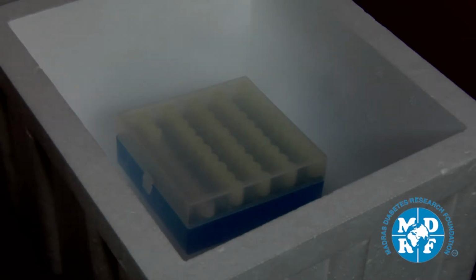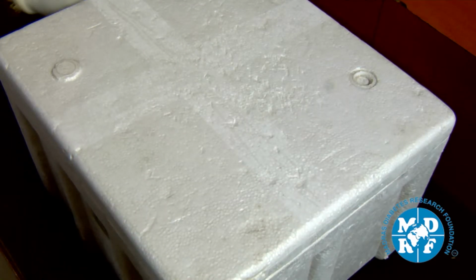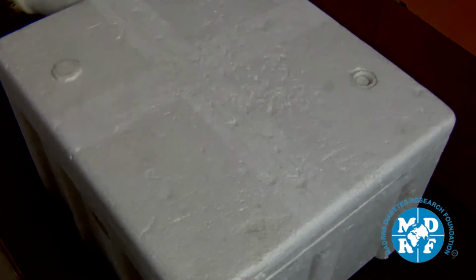Arrange the dry ice on all four sides of the vial box as well as on top of the vial box. Now close the ice box and tightly secure the knob of the ice box. Care should be taken to always hold the ice box upright throughout the transfer of the samples.